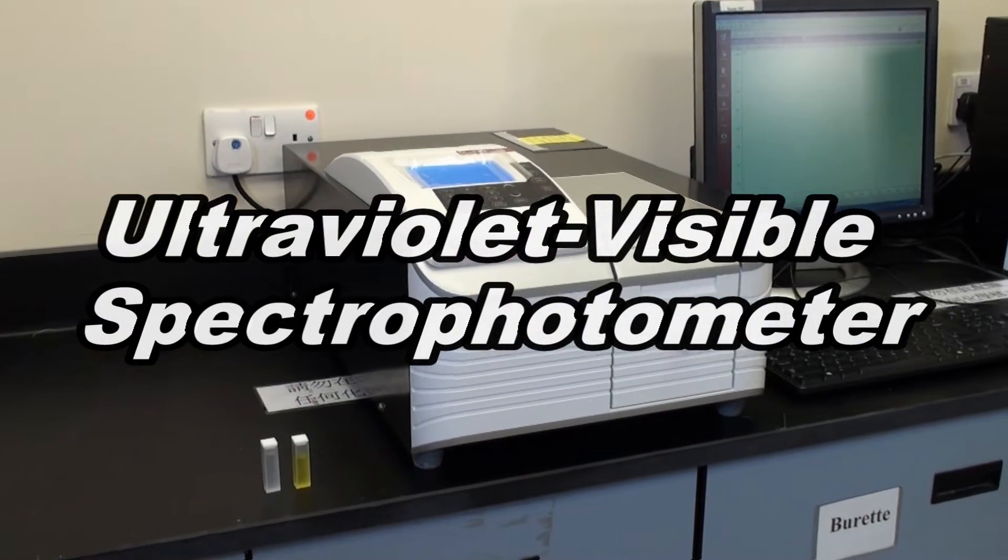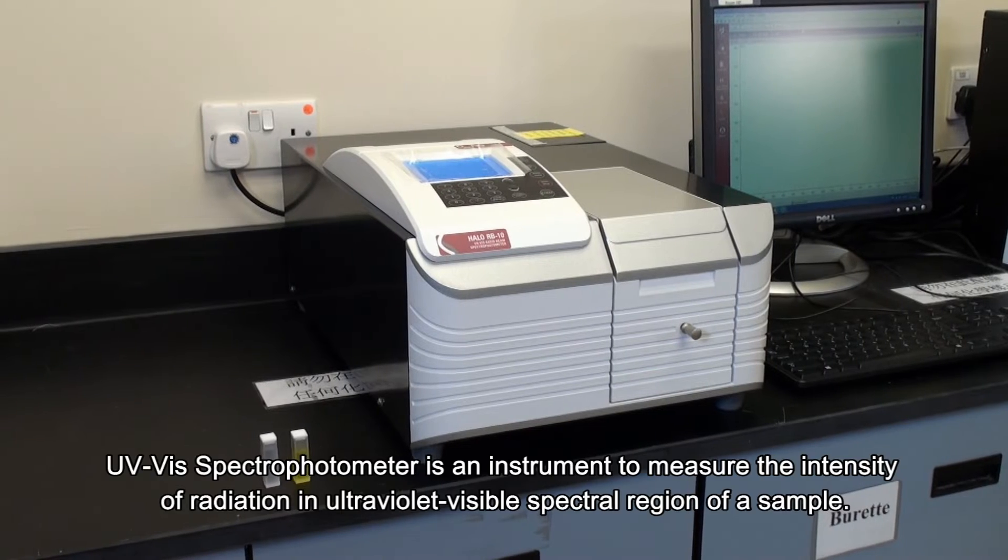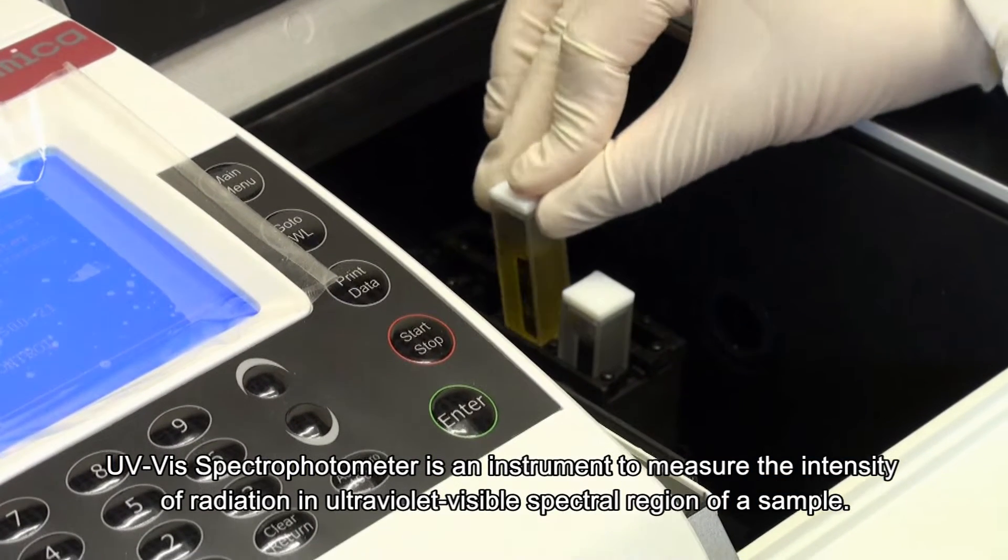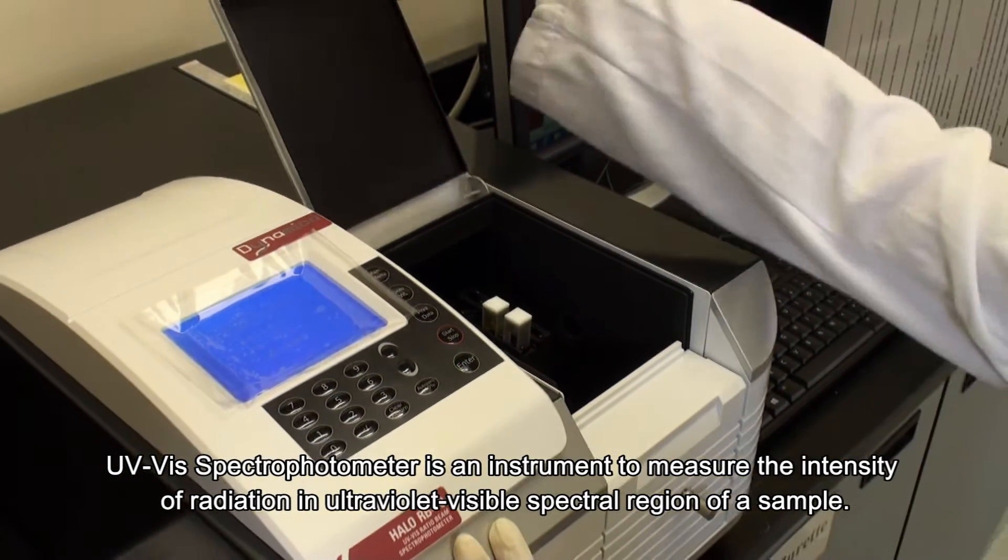Ultraviolet visible, UV-vis spectrophotometry. UV-vis spectrophotometer is an instrument to measure the intensity of radiation in ultraviolet visible spectral region of a sample.